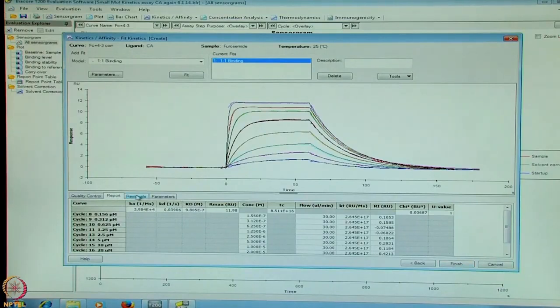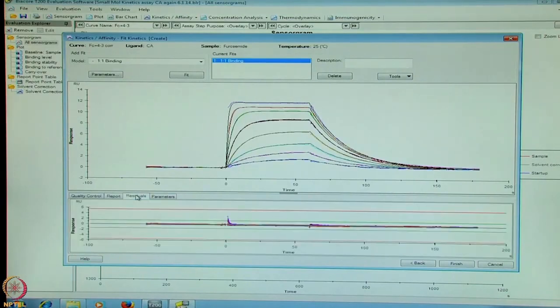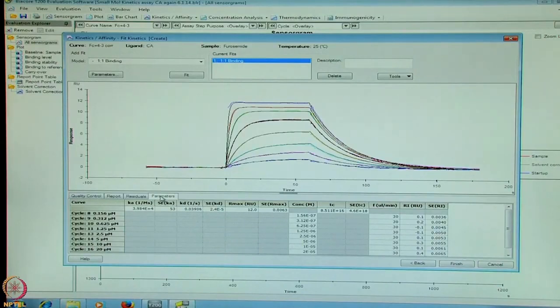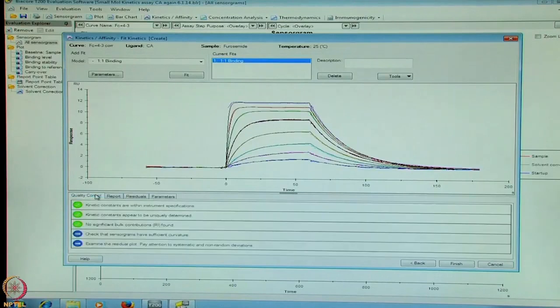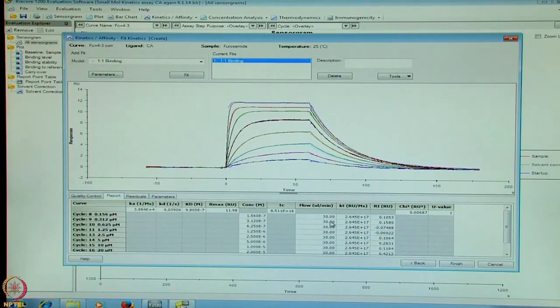With this, we go to the next tab and analyze the data. Here, with the one-to-one fit of the data, the residuals or the differences from the black line to the colored line should fall within the green areas or at least within the red area. Here they are within the green areas and it looks absolutely good to proceed with this data. Similarly, other parameters like the standard error is provided here. With this, we will conclude the kinetic information generated for the interaction of furosemide with the ligand carbonic anhydrase recorded at 25 degree centigrade and solvent corrected for the DMSO presence in the running and the sample buffers.